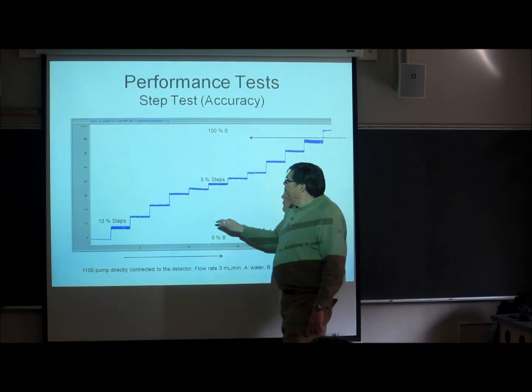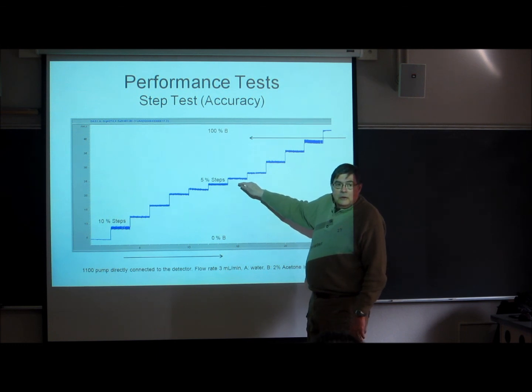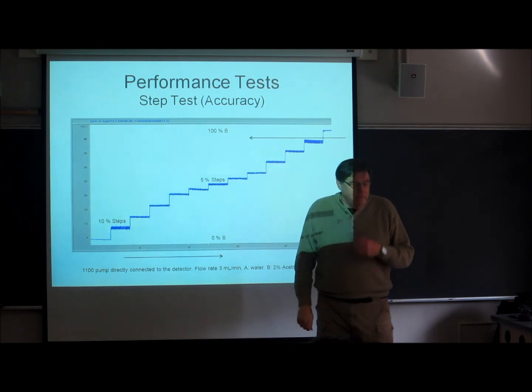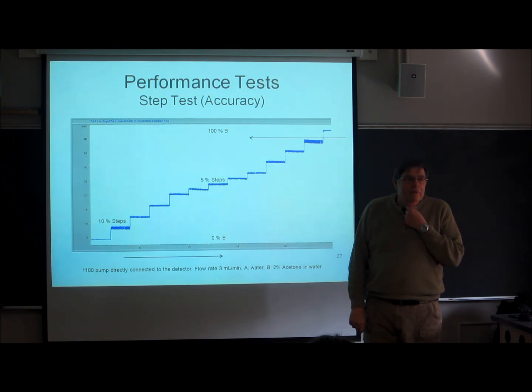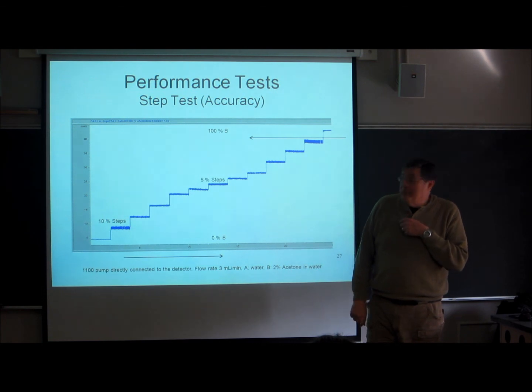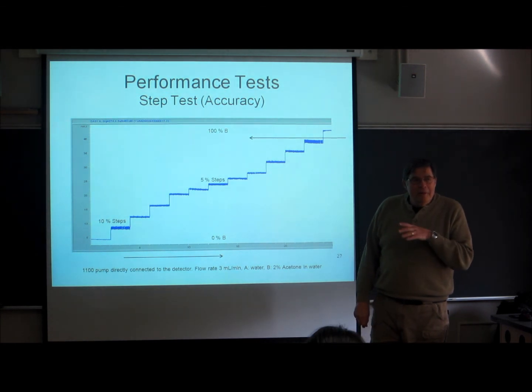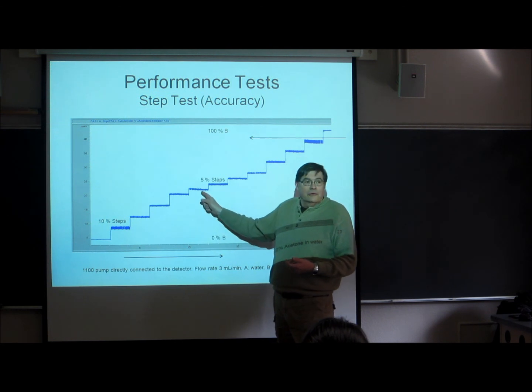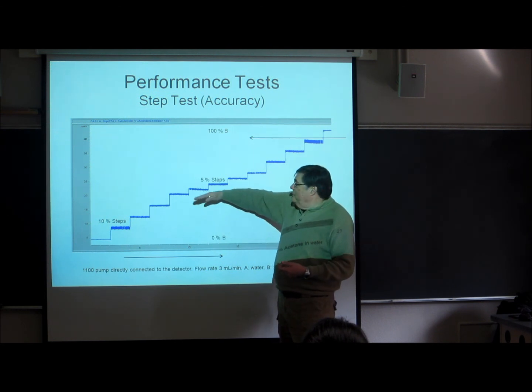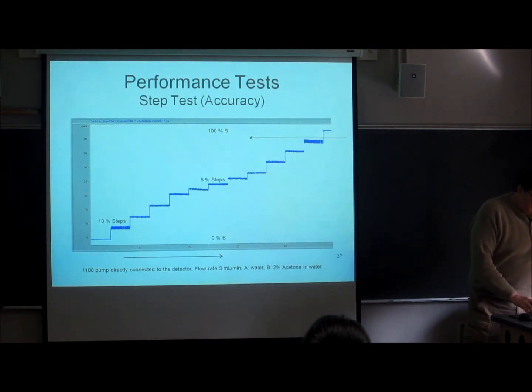Okay. See, are these perfectly flat? What do you think that might suggest? What would you look for? Anything come to mind? I mean, maybe they're supposed to be perfectly flat. Maybe it was, but it came from Agilent, I believe. Looks like it might be a leaky seal on one of these pumps, maybe. I don't know, but that's where I would start looking for trouble. Ideally, these would be perfectly flat and perfectly straight. We're just about out of time.